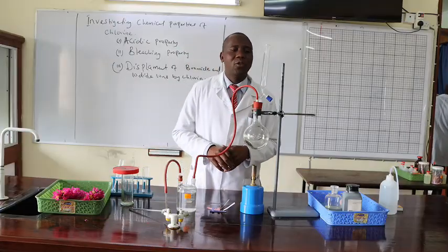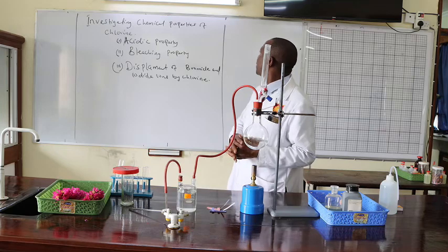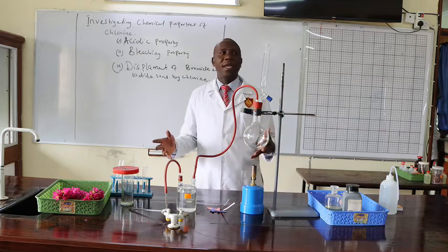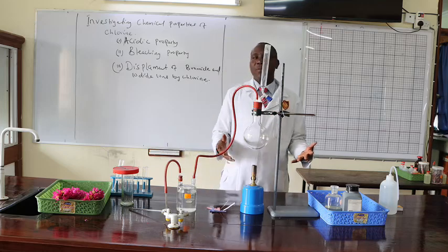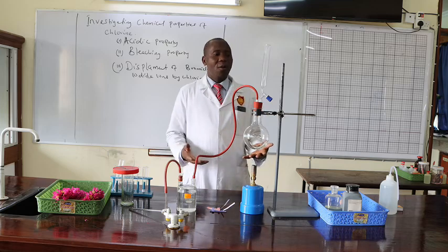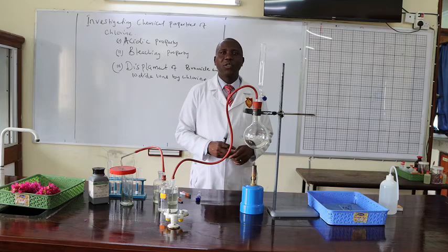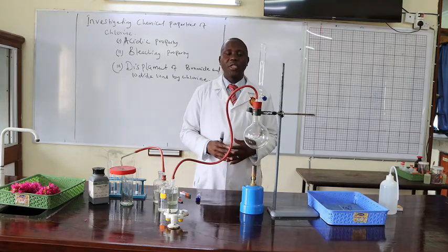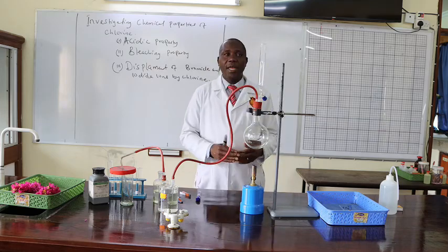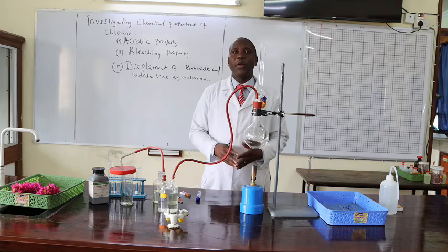Welcome to our lesson today. In this lesson, we are going to investigate the chemical properties of chlorine gas. First of all, we begin with preparation before we move on to our investigation. In our lesson today, we will discuss the preparation of chlorine and investigate the chemical properties of chlorine.